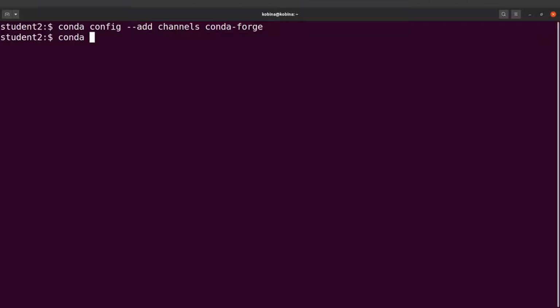So we give the same command and then we add a channel name, which is bioconda. So let's run this.